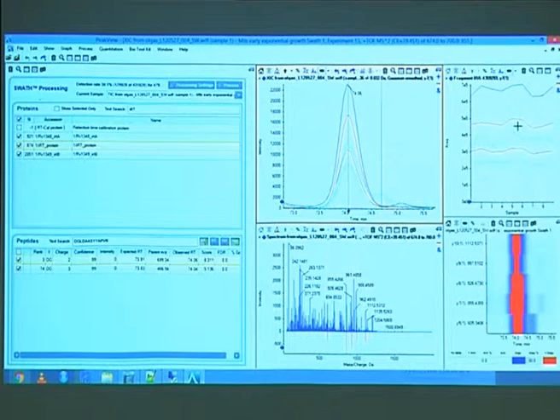This one here is also important. These are the areas of the individual fragment ions. And if you look at it that way, you see they should be fairly straight. That peptide should not change. You always spike in the same amount. And it couldn't change because of different expression levels or different sample handling or something. You spiked in the peptides before the analysis, so they should be flat.